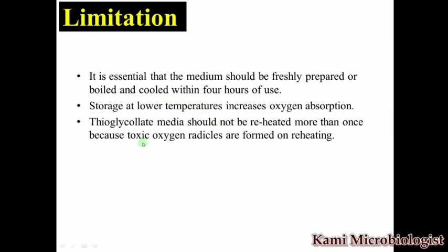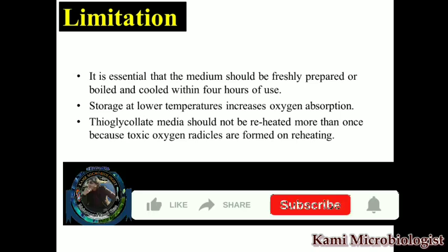Then we have the limitations. The limitation says that this type of media is essential to be freshly prepared, or boiled and cooled within 4 hours of use. This is really important. The next point says that storage at a lower temperature increases oxygen absorption. Okay, remember. Then the next point says that thioglycollate media should not be reheated. Okay, why? Because when it is reheated, toxic oxygen radicals are formed. That's why it should not be reheated again.